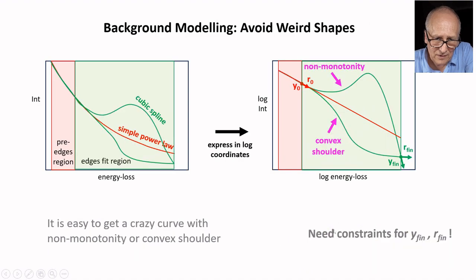Well, so far so good, but if you try to fit within this approach, you immediately come to a great problem. Your background very often would go crazy with some strange shapes, and the system would still pretend that the fitting is the best.